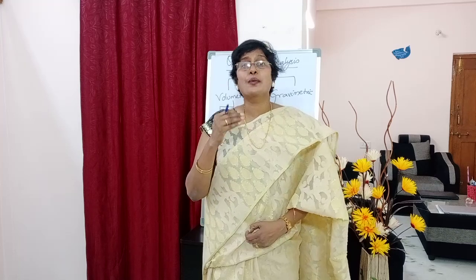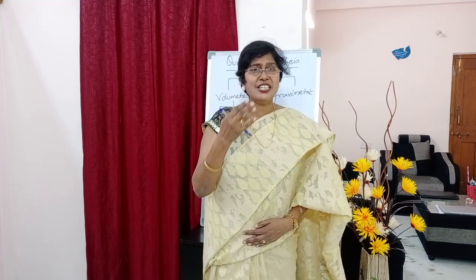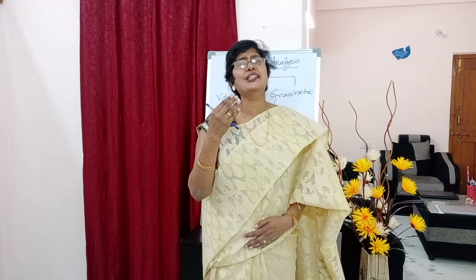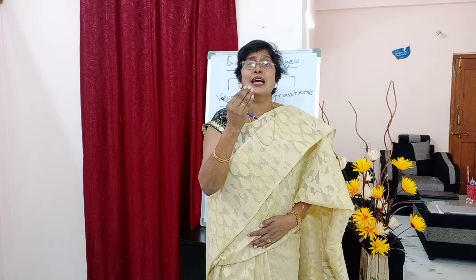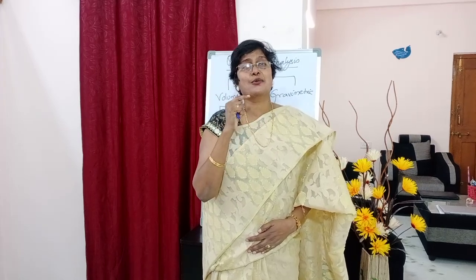Okay. So now this year, second year, you are going to do quantitative analysis. Qualitative means what are the constituents present in the mixture. Quantitative analysis means we are going to determine the amount of the substance present in the given solution. Okay, so that is quantity, and that was first year, a qualitative analysis.